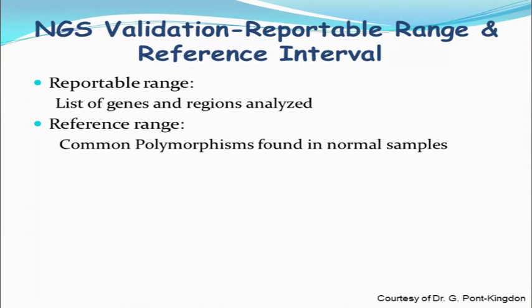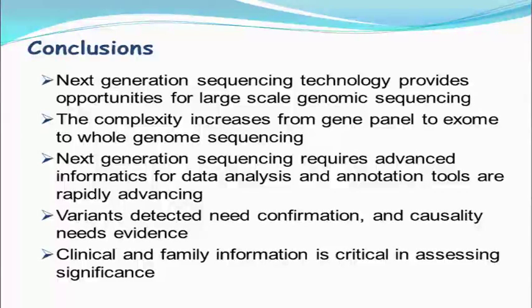So to conclude today's presentation, next generation sequencing technology provides opportunities for large-scale genome sequencing. The complexity increased from gene panels to exome sequencing to whole genome sequencing.